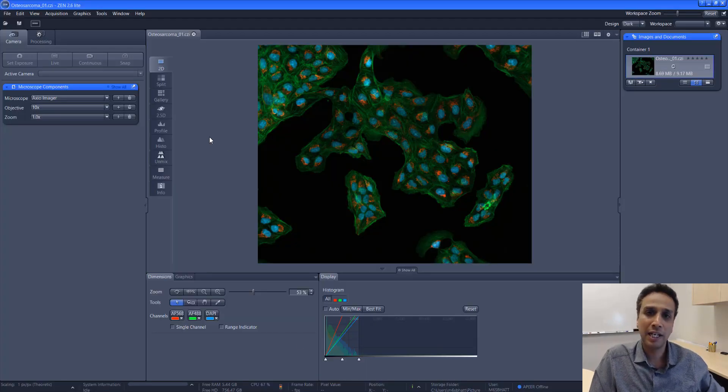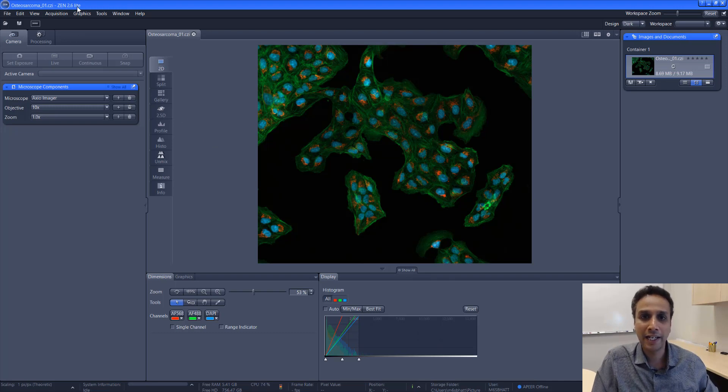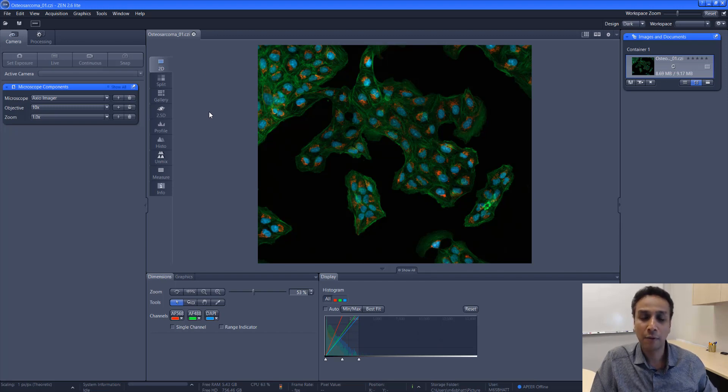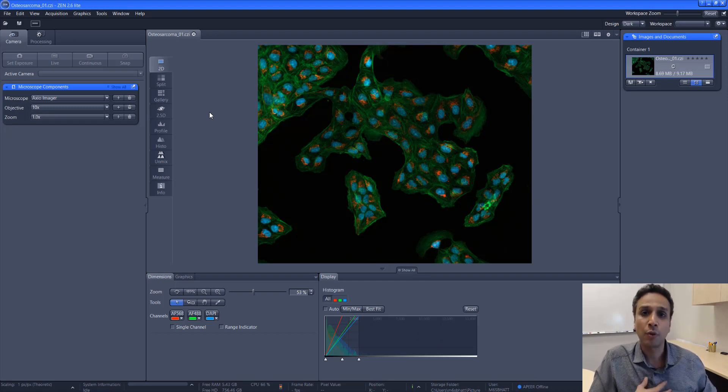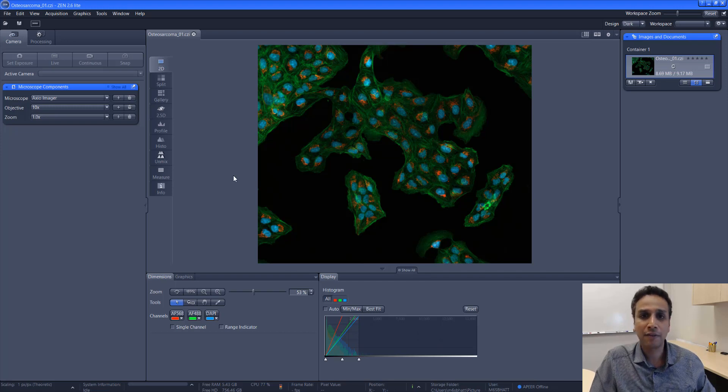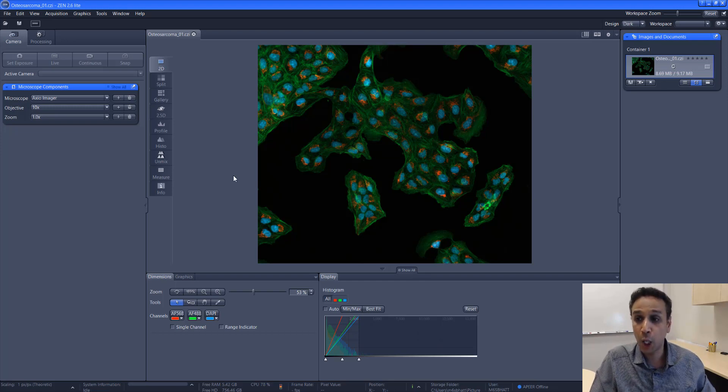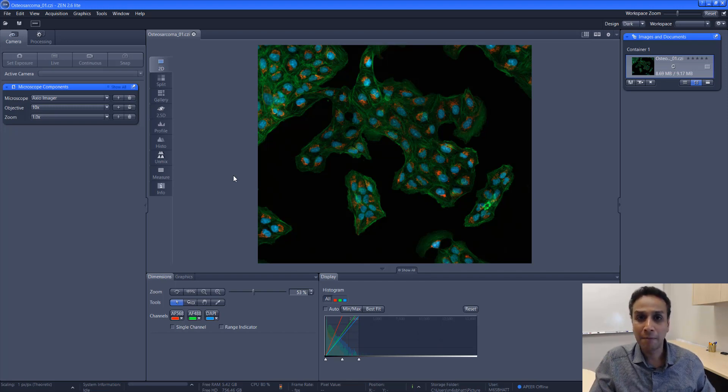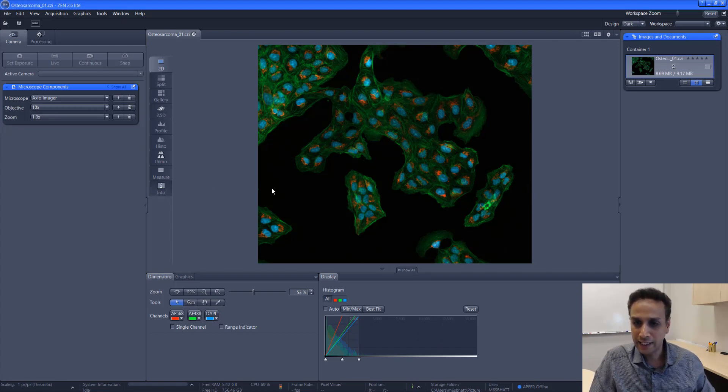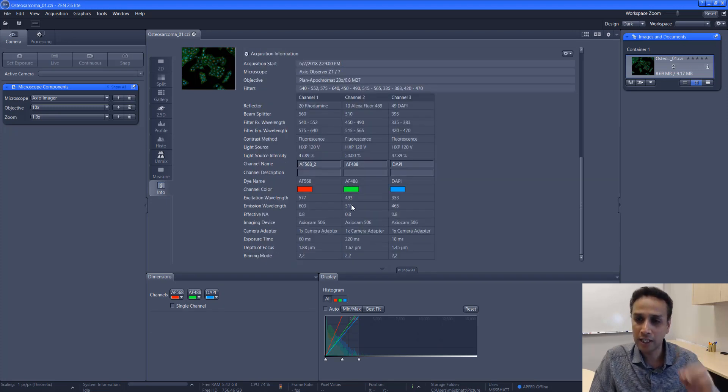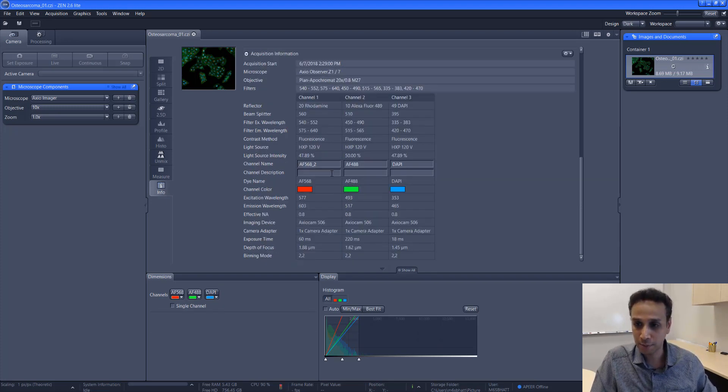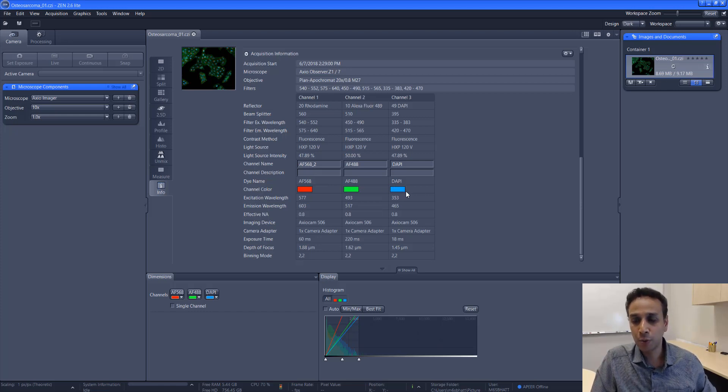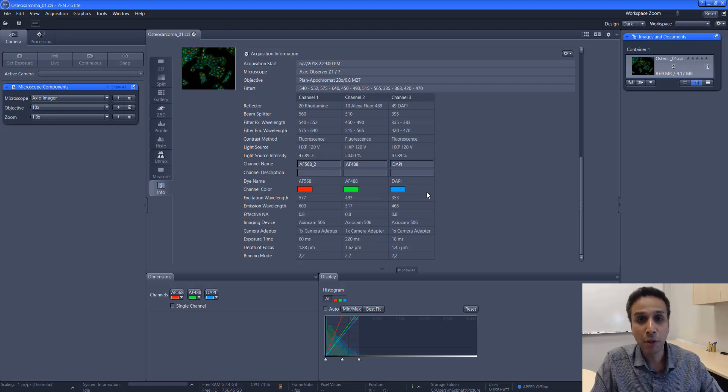Getting back to the image, I opened it in Zen Light software, which is free software that you can download from Zeiss website. Here is the image that I'm going to use. This is a fluorescence microscopy image and the sample has been stained with multiple dyes. The dyes used in this specific image are AF568, 488, and DAPI. DAPI is this blue, in this image it looks blue color.